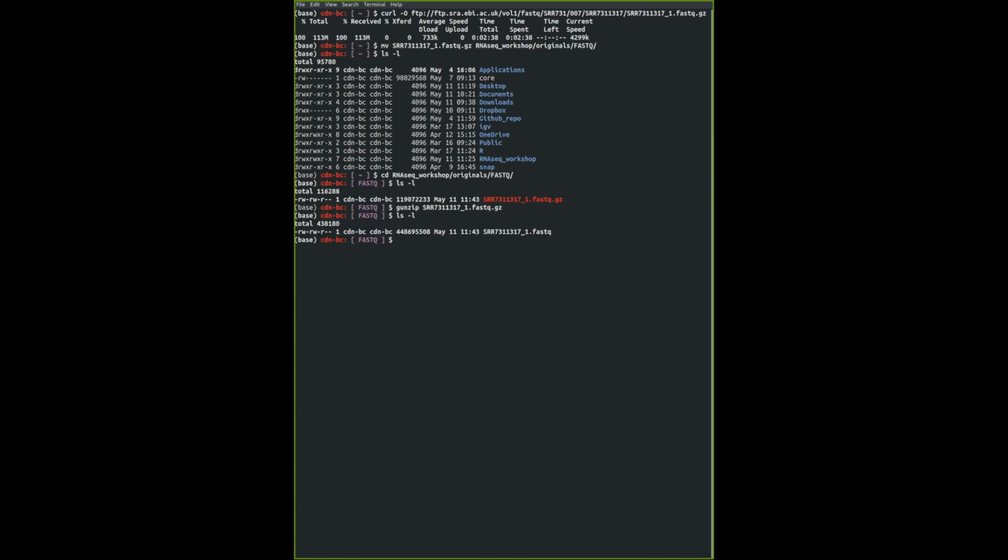If you don't want to inspect, you're just doing the normal workflow, we don't necessarily need to unzip. We're not going to unzip this in the next 2 weeks. So we usually keep it in a compressed file because it saves space and it's easier to deal with. But if you were to preview a compressed file, it's going to print out binary, as I think Pat saw, because it's trying to print out the contents of that file in these very weird symbols. It's all a binary compression.